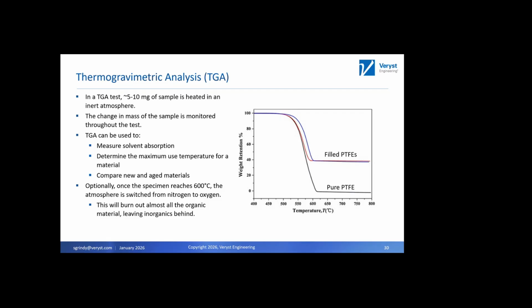I like to think about it as a range, but when you're comparing materials, it is sometimes just helpful to have a single number. So the way I like to do it is to report the Tg so that we can compare to, let's say, a specification sheet or a different material. But when we're thinking about setting, let's say, a maximum operating temperature for our material, think about it as a range. It's just helpful to keep that in your head.